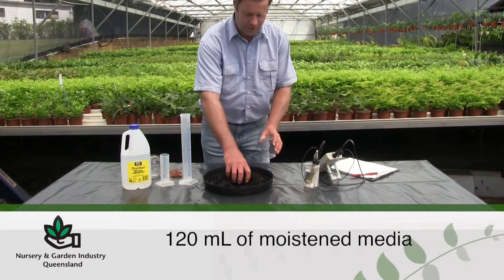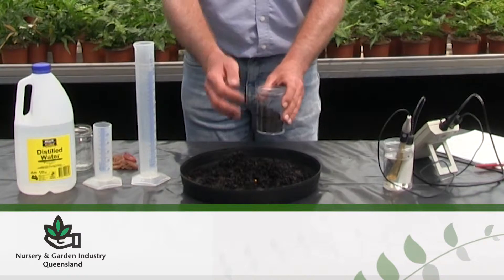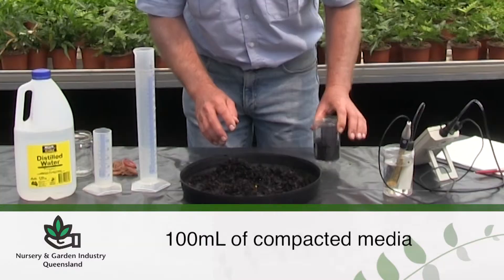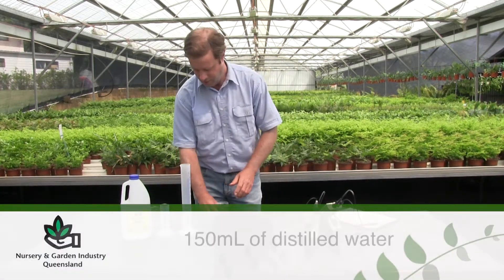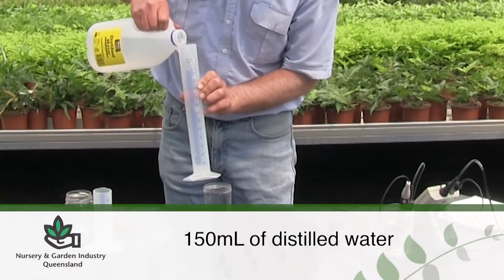Take 120 millilitres of moistened growing media and tap down to give 100 millilitres of compacted media. Then take 150 millilitres of distilled water and add to the measured growing media.